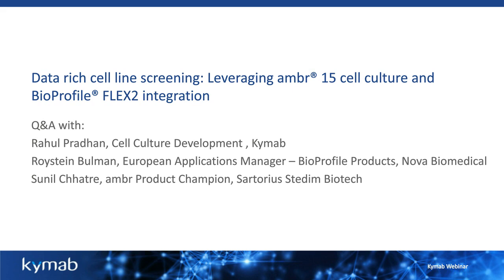Another question for Nova. How long does it take from the vessel being sampled to the moment the results are obtained? So that is 6 to 7 minutes from sample acquisition to the data appearing on the ambr computer.